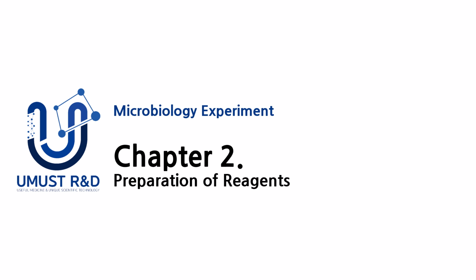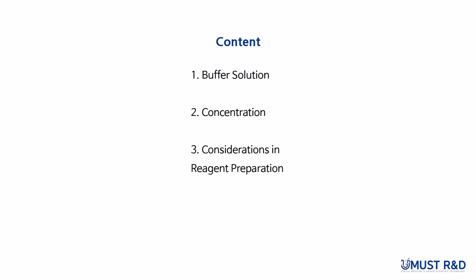In this lecture, we'll learn about the basic concepts necessary for preparing reagents used in microbiological experiments. Here is what we'll cover today. A buffer solution is a solution that maintains a constant pH environment, which is crucial because microorganisms are very sensitive to pH. Thus, making buffer solutions is important. To make buffer solutions, we will first learn the concept of concentration. Finally, we will conclude the lecture by reviewing what to consider when actually preparing reagents based on the concept we learned today.